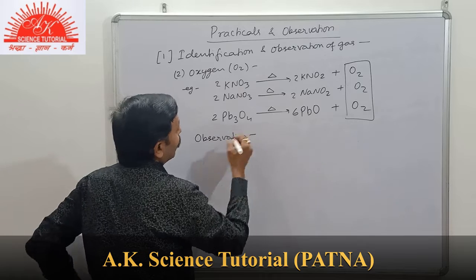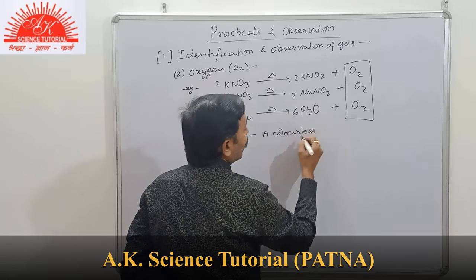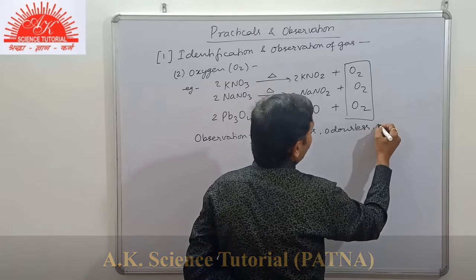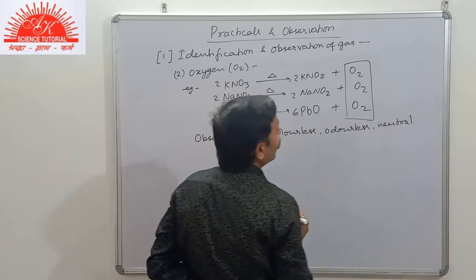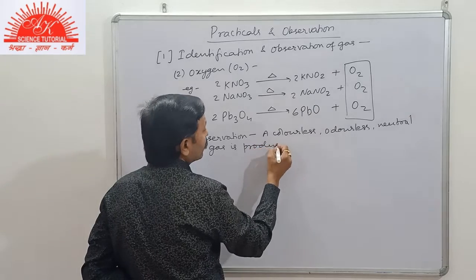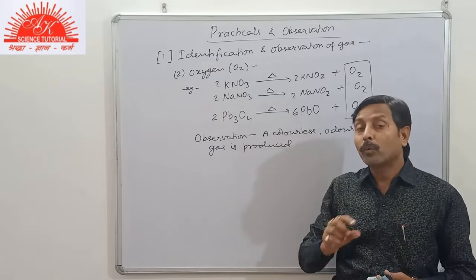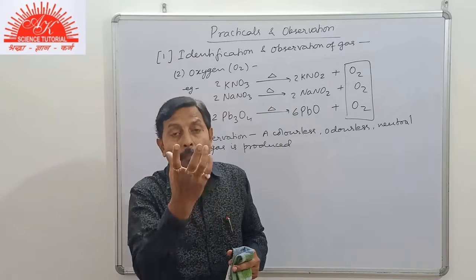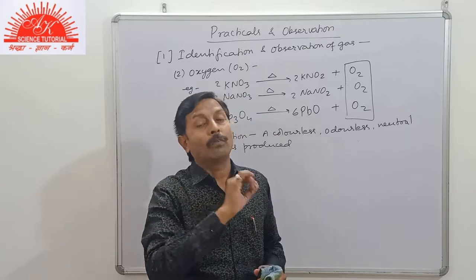A colorless, odorless, neutral gas is produced. We do not write here evolved, because the word evolved will be used when the reaction is taking place in solution state. Then the bubbles of the gas will rise. At that place we will use the term evolve.